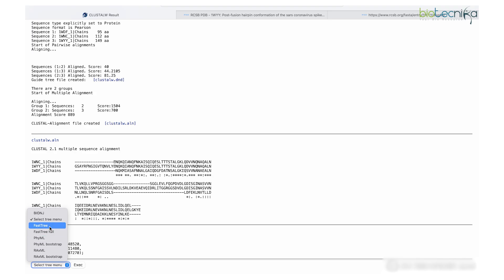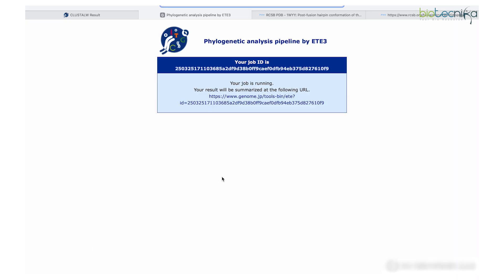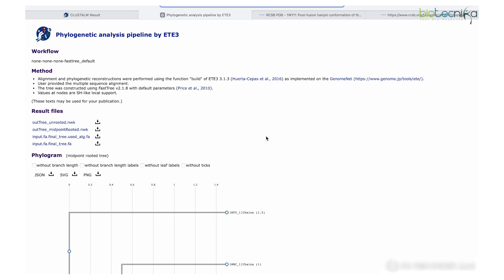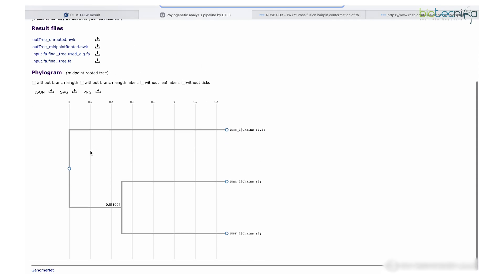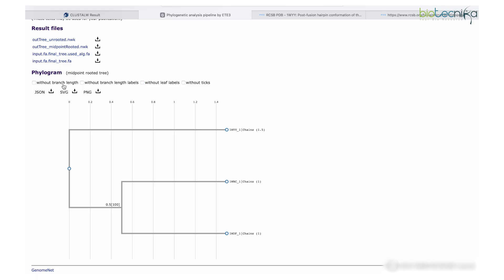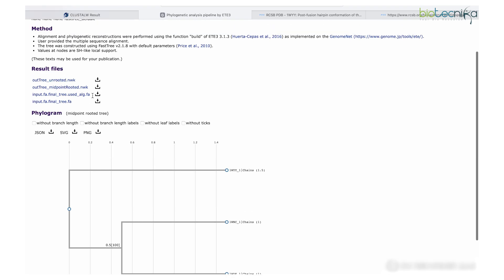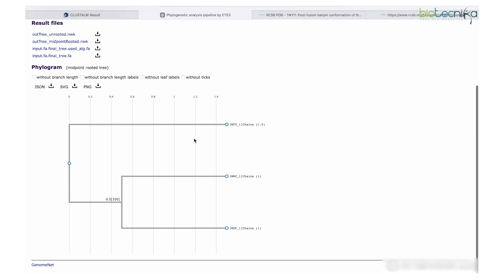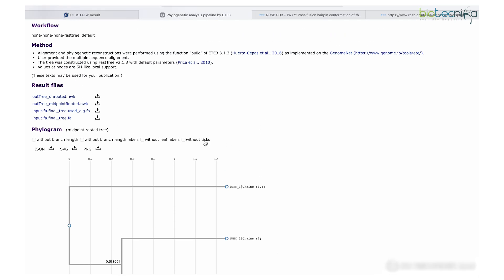If you want to understand evolutionary relationships via a phylogenetic tree, you can select different tools at the bottom. Here you can see FastTree, which is a tool to generate a phylogenetic tree. Hit Execute and within a few seconds it gives a tree — which can be a rooted, unrooted, or midpoint-rooted tree. Here we are getting a midpoint-rooted tree. You can display it with or without leaf labels, and download results in different formats: FASTA, dot-nwk (Newick), PNG image, or JSON format.